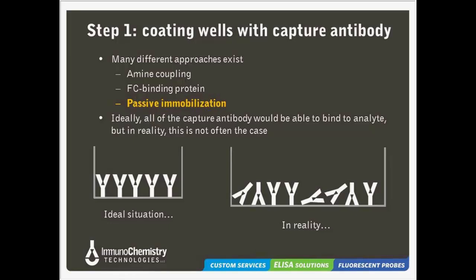Now, in this slide, we're going to talk about coating buffers. Traditional coating buffers started out back in, I'd say, probably the mid to late 70s. And that's when I was cutting my teeth in this area. That tells you how old I am. Anyways, the plates that they put out there weren't very good. They did not do a very good job of binding proteins, and good luck if you had an LPS or carbohydrate or something, because that was really a problem.